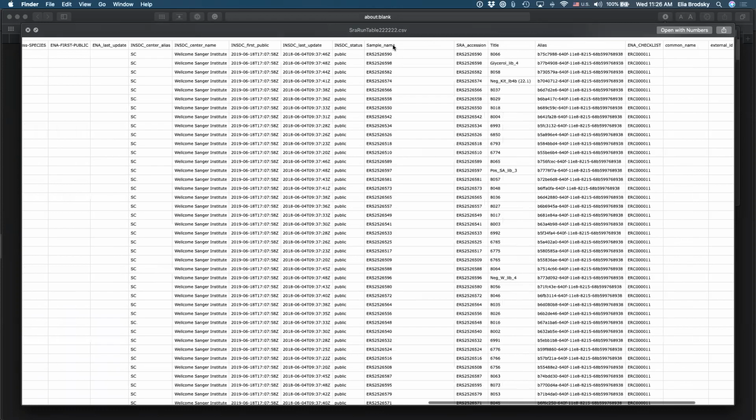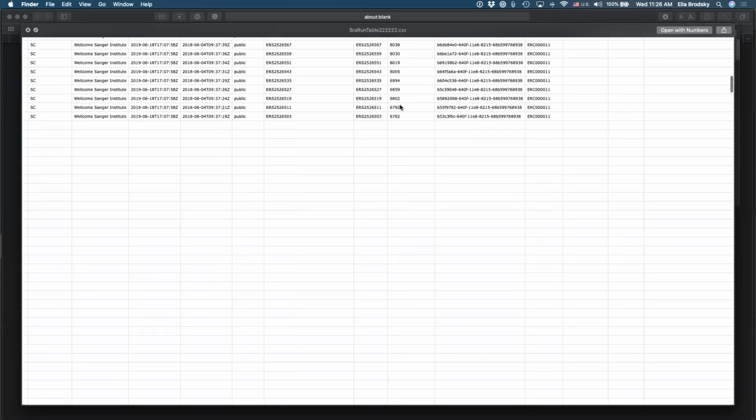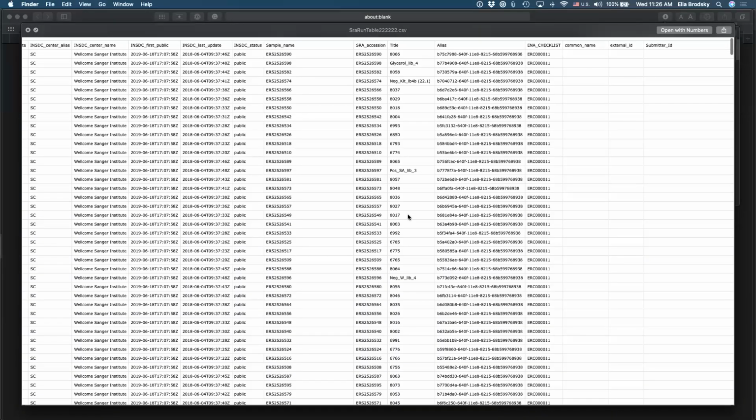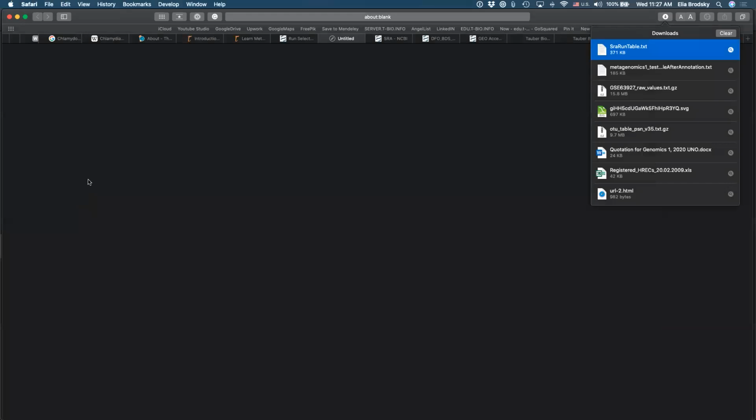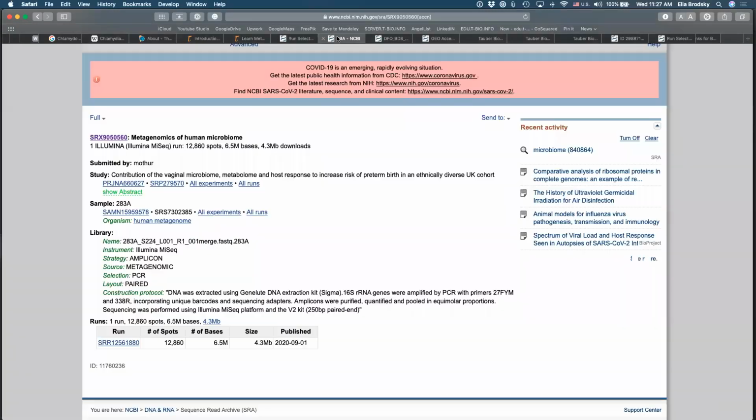Okay, and here you have some title. So the title is probably what you want to look for to understand what is in the data. But again, now you're on a path to combine all of this annotation about the samples to plan your analysis. Okay, so when you want to apply some of these methods, you really need to plan it out to understand what kind of information is available.